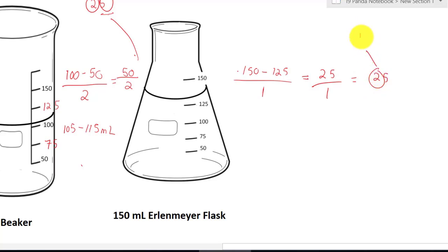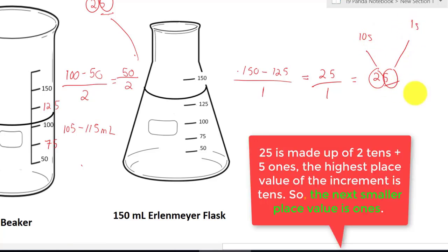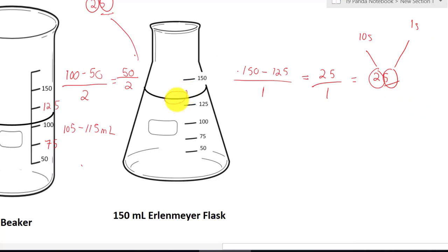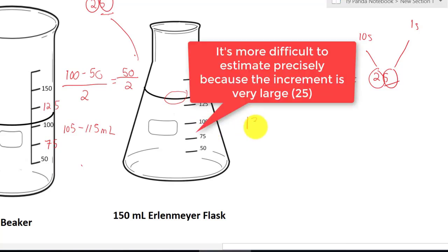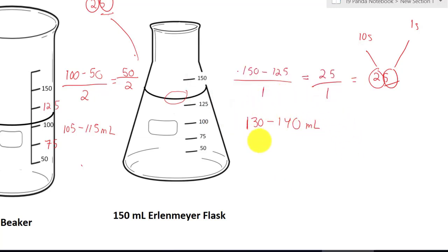The same thing, your 2 is going to be your tens, so your 2 will be your tens. Your 5 will be your ones. We estimate on the ones. And our meniscus is right here. So that will be between 130 to 140. Notice the answer is very rough because the value of the increment is very large.